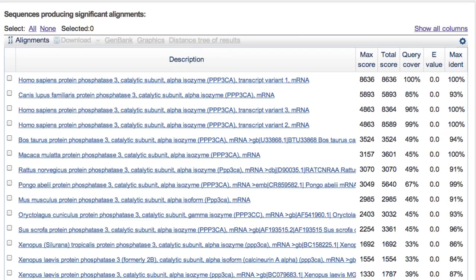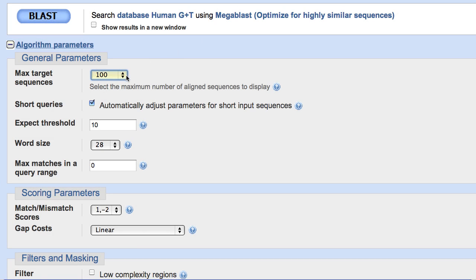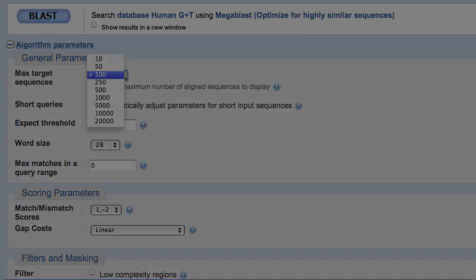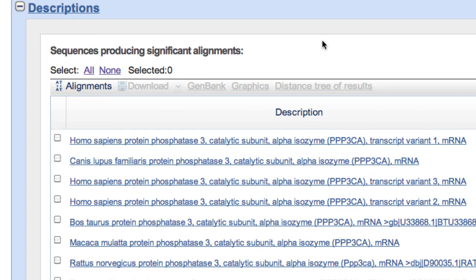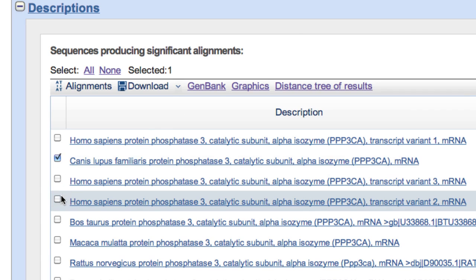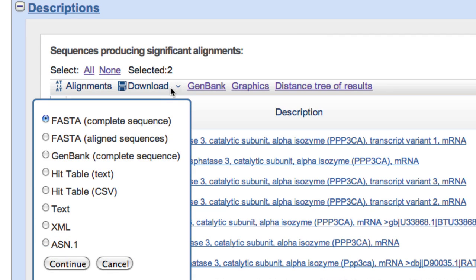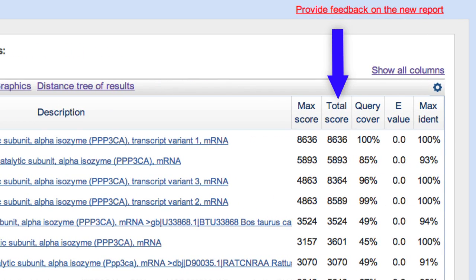The number of descriptions displayed is still limited by the setting for max target sequences on the submit page, which is 100 by default. To view a specific alignment within this page, you would click on the description, or you can click on alignments. Note that many options are unavailable — shown as grayed-out text — until at least one description is selected. One of the most important new features is that you can now download only the aligned region of the subject or hit sequence. These columns can also be sorted by clicking the column name.